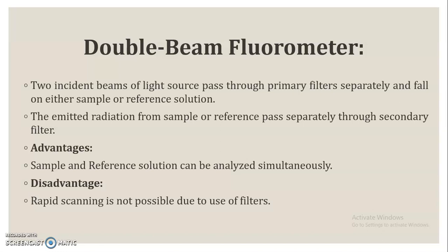Now, Fluorimeters mainly consist of the use of filters. Today, higher versions of Fluorimeters are available, which are known as spectrofluorimeters. The use of the Fluorimeter and spectrofluorimeter is the same, only the way they work is different. In spectrofluorimeters, we use monochromators instead of filters, because due to the use of monochromators, we increase the accuracy as well as the precision.